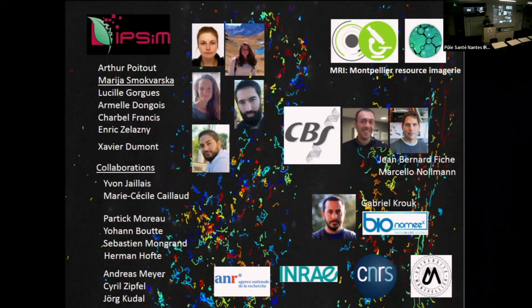Because we are working on full organs, we just take the roots and look at the epidermal cells of the roots. And this was really easy to actually generate data. Then the main thing for us was really to understand deeply, or at least as much as we can, the analysis below and what we can extract exactly, how we are making it, when we are making errors, and how to set the tracking properly. All those things were a bit more work, I would say.